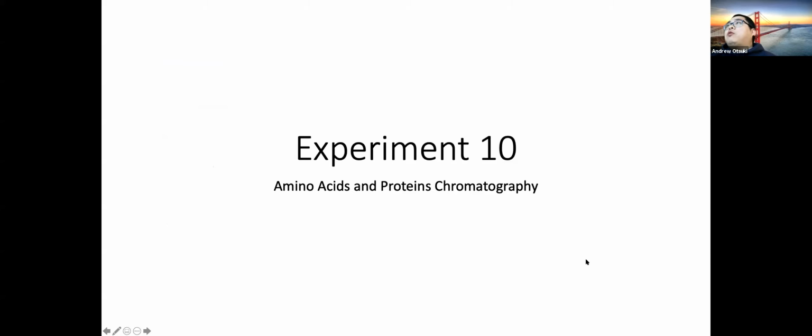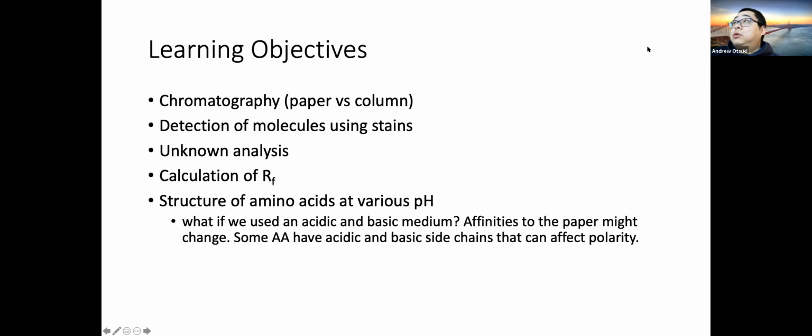Moment, we will go over again the topic of chromatography, but this is one that's a little bit different because we're not going to be using a column. We're going to actually be using paper chromatography. So let's talk about what that is.